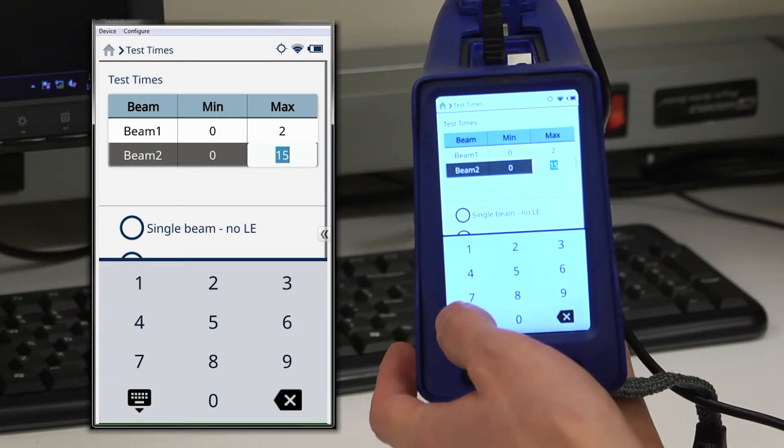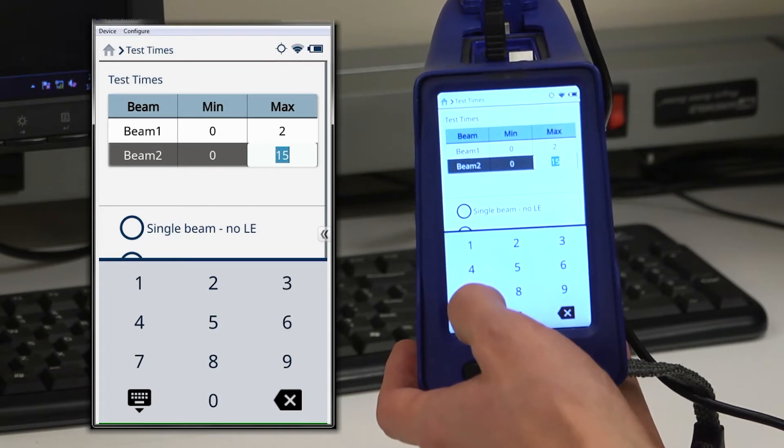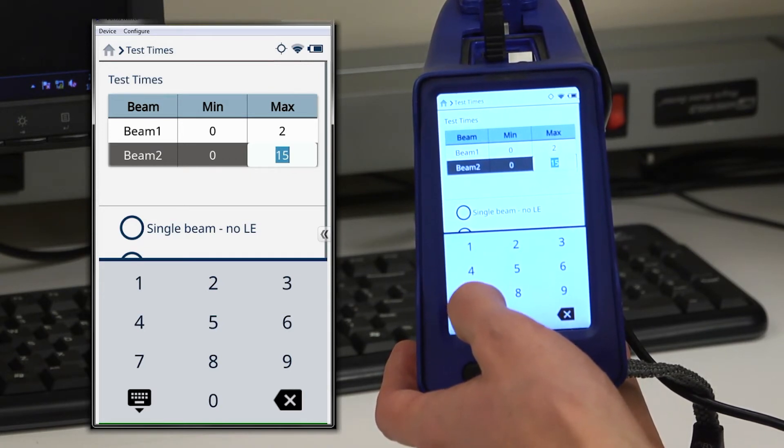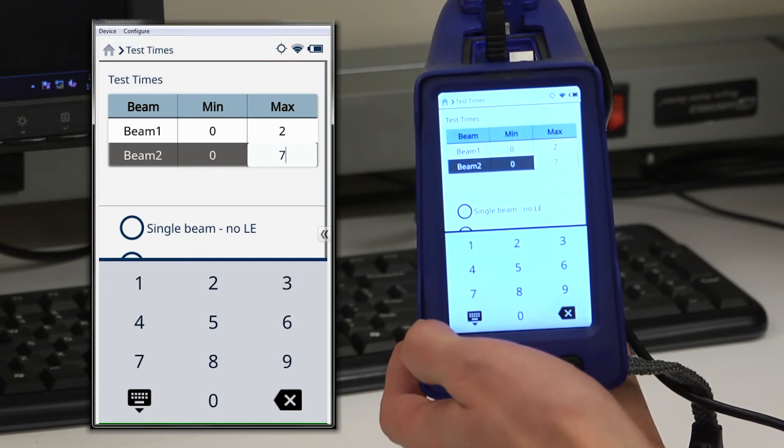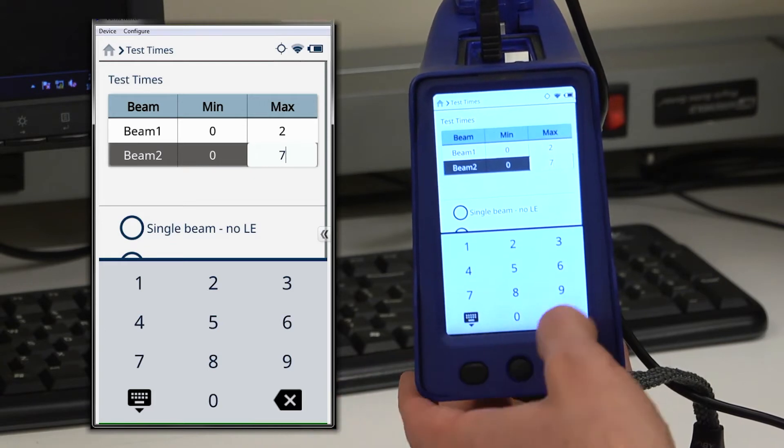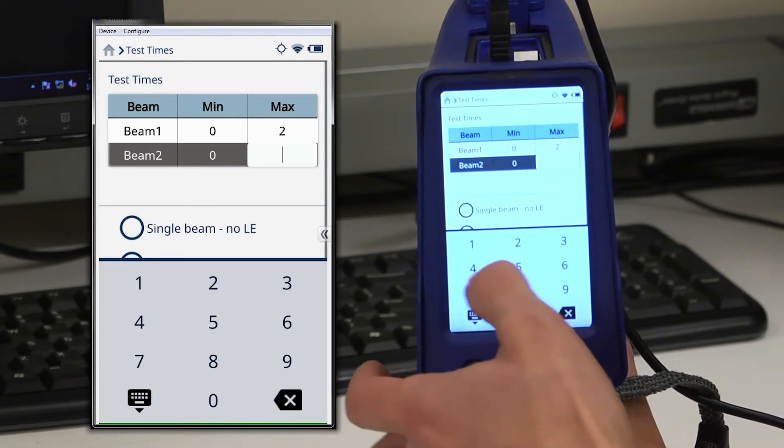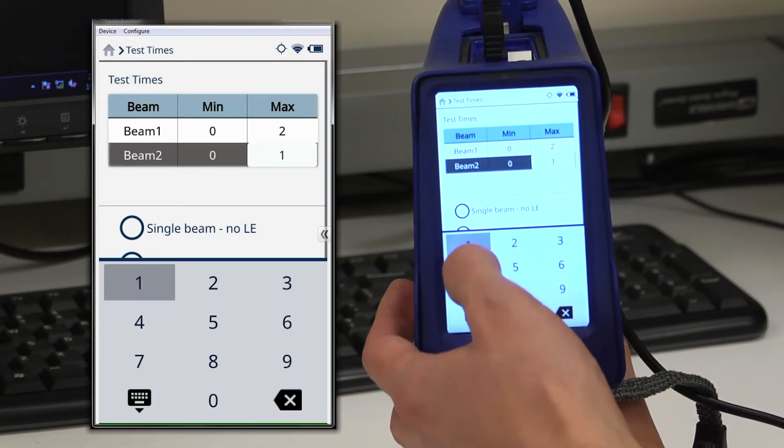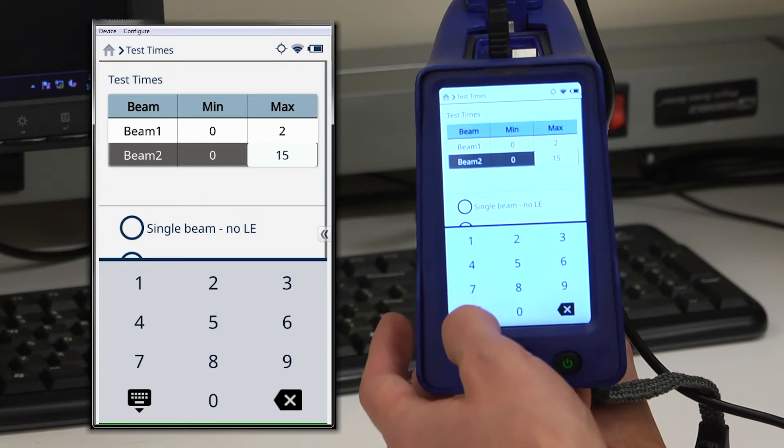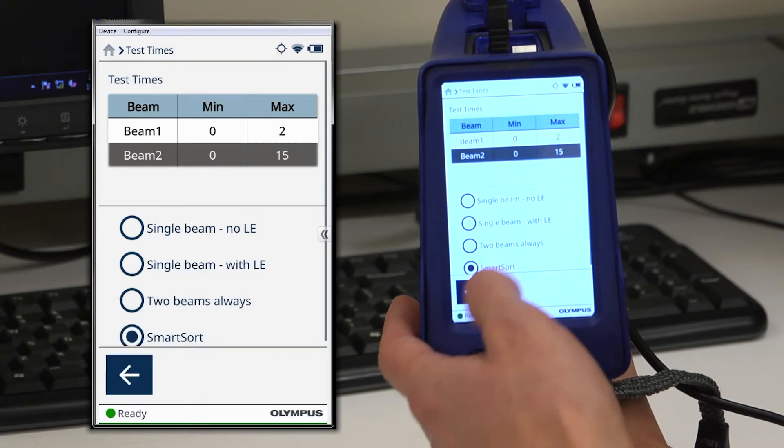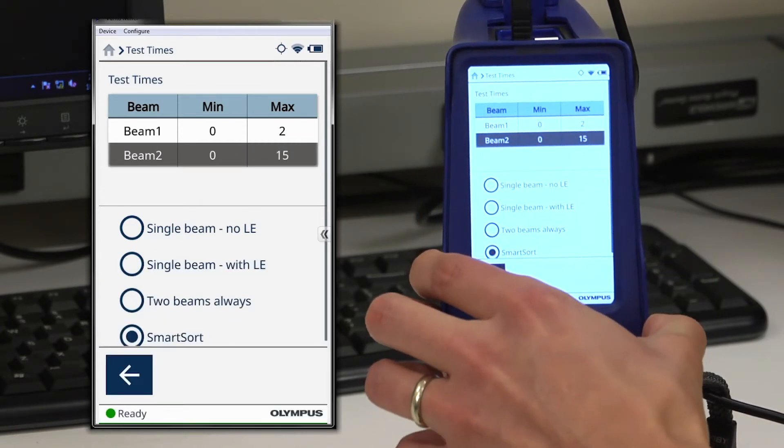For general alloy sorting, I would recommend a test time in beam two of seven seconds max. Or if we're doing aluminum with lower levels of magnesium, maybe 15 seconds is adequate to provide that information.